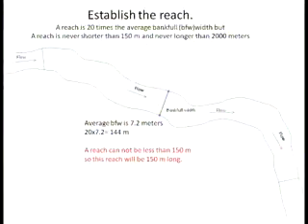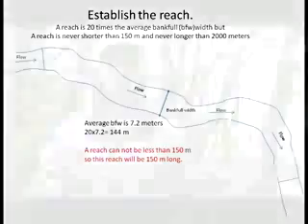This is a pretty straightforward process. It can be completed by a single crew member, and it's generally one of the first tasks that are completed when you arrive at a site. Before you can collect your samples, though, you need to establish your reach. Our programs work on a reach-wide basis. We collect a lot of different habitat and stream information on a reach-wide basis. So a reach is generally defined as 20 times the bank full width, although a reach is never shorter than 150 meters and never longer than 2 kilometers.